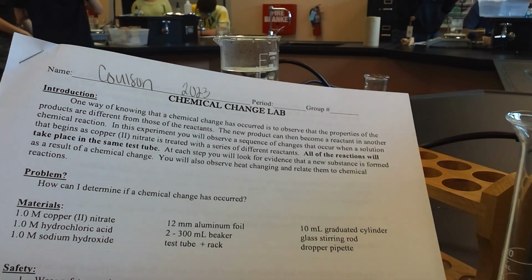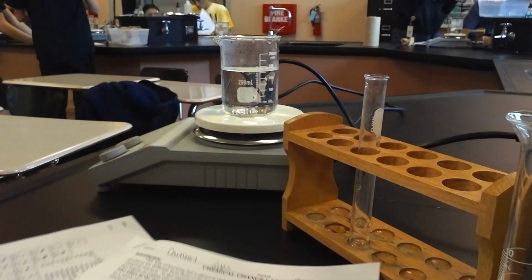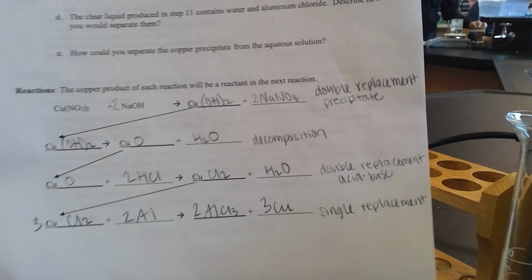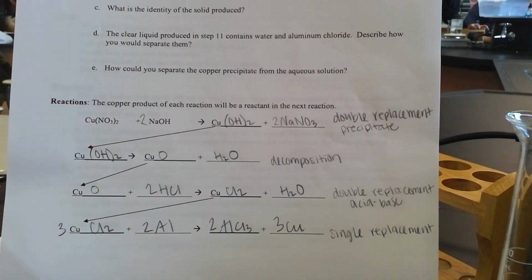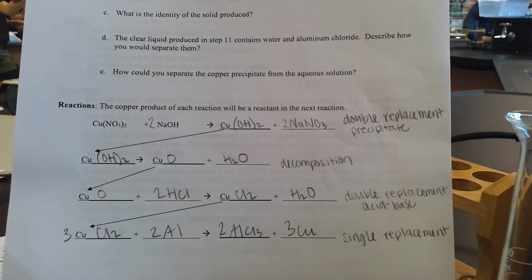Going over the Evidence of a Chemical Change lab. This document has been posted to Canvas. Starting with the pre-lab that you were to do before coming to class on the day of the lab, we are writing and balancing our equations. And then you should also be able to identify what type of reaction everything is.